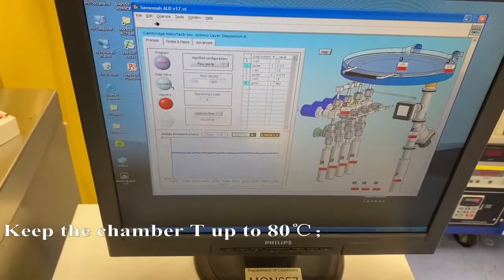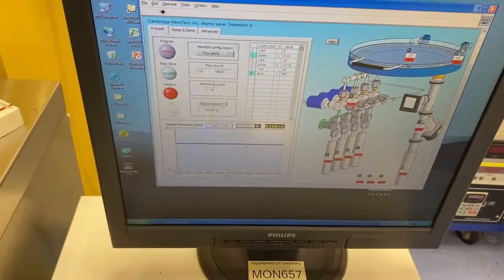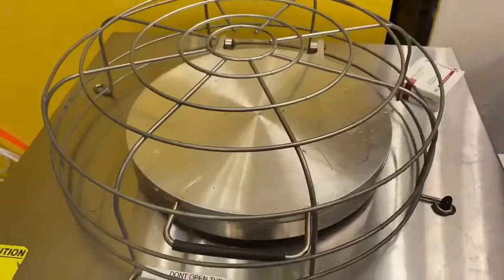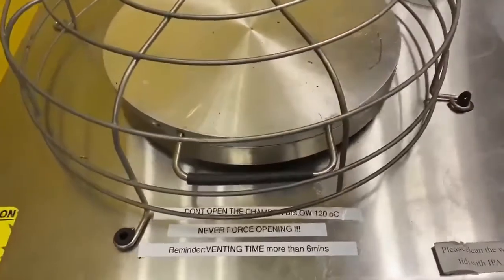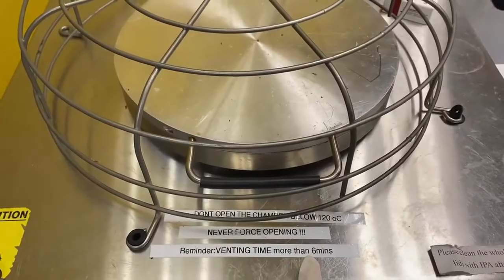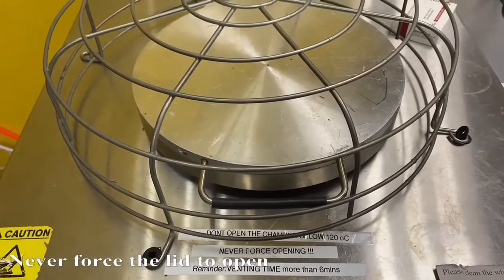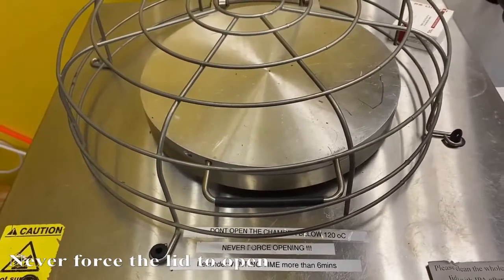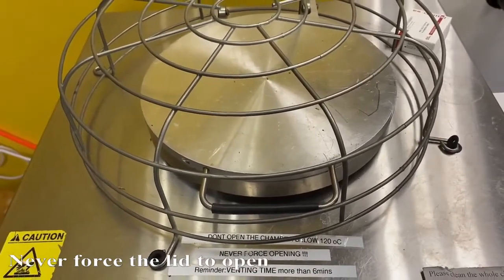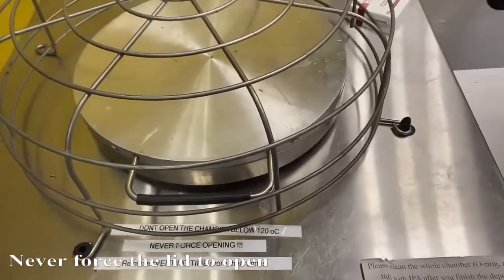Now we can see from the graph that the pressure in the chamber has become higher. So we need to wait for the lid to rise slightly from the chamber. It will take a few minutes. Please be patient. It is important to wait for the chamber to reach atmospheric pressure to preserve the integrity of the O-ring, because the O-ring in the chamber is very expensive, so we cannot force the lid open. It should open without any effort.